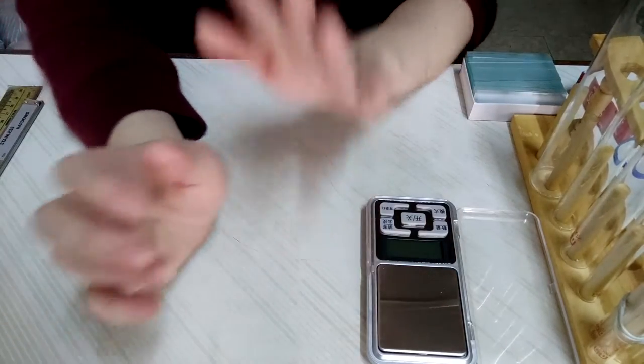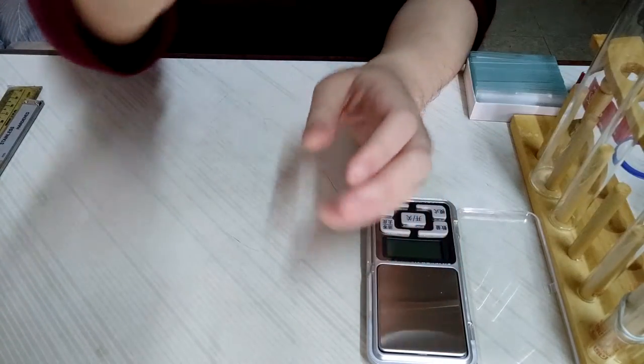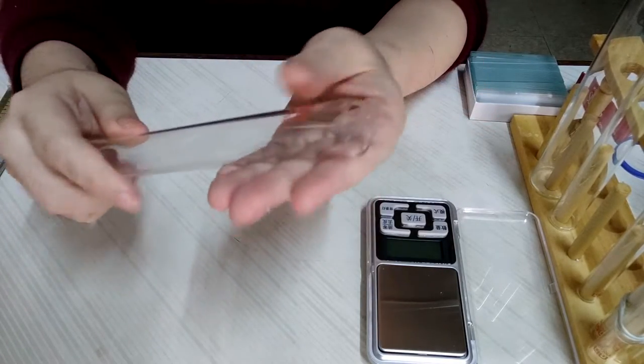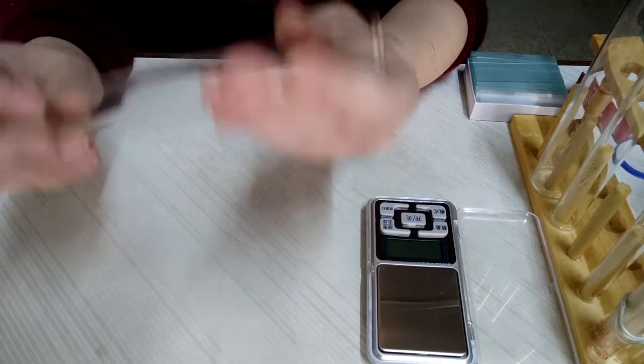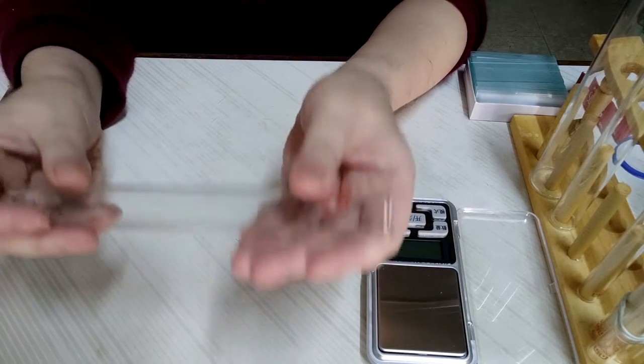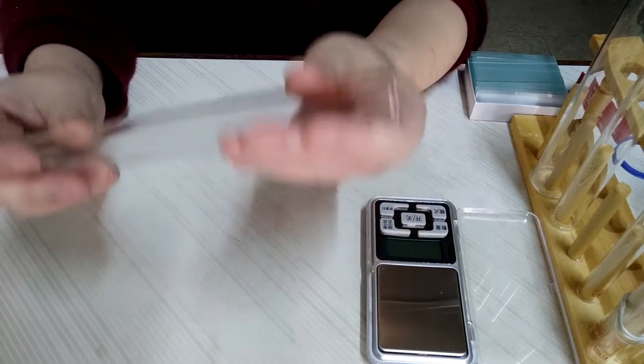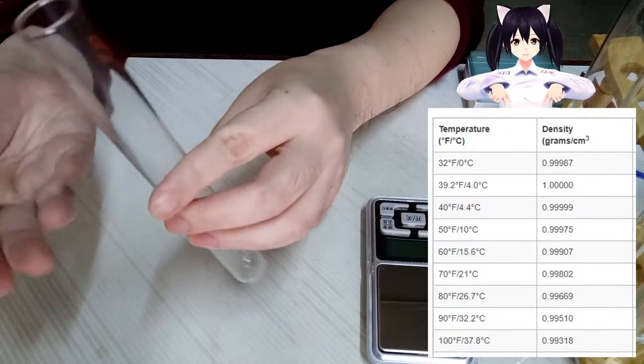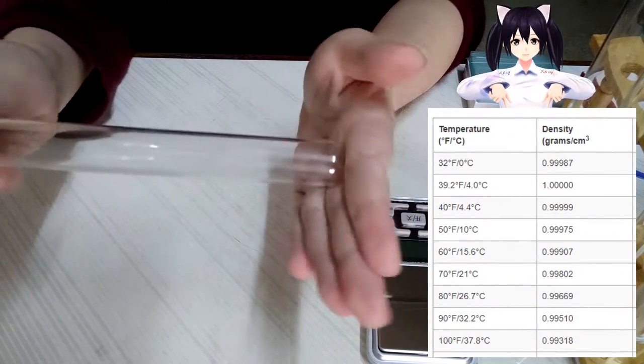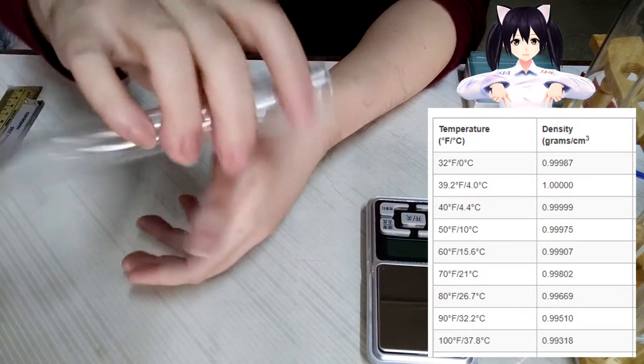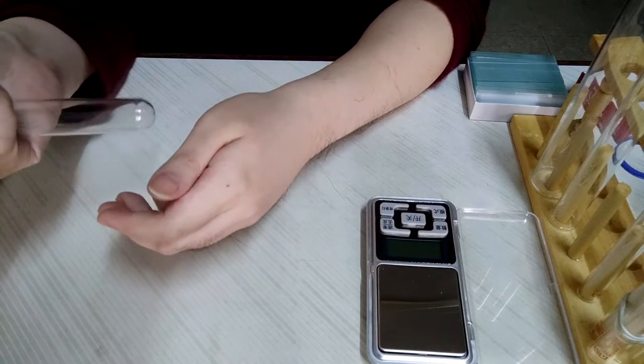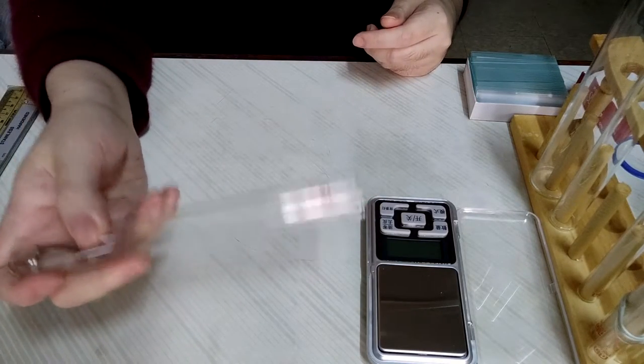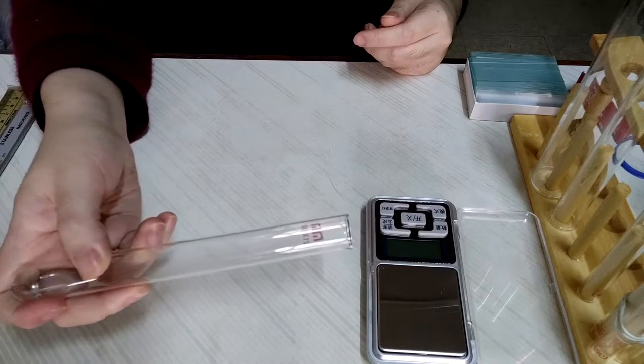I am going to estimate the capacity of the test tube without using any measuring cylinder. This water is very close to 1 gram per milliliter, so I can just fill up a vessel with water, then pour out the vessel and measure its weight. How many grams of water there means how many milliliters.